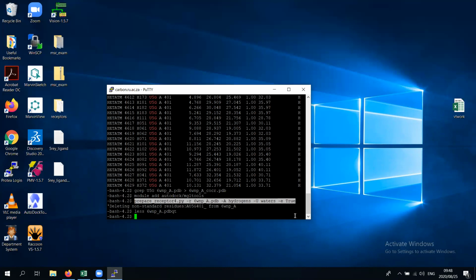And so this is what I would do in my day of work, if I've got many receptors to work with. I won't be clicking step by step. I'd rather use a script or something that helps me type this command several times rather than tediously work through many structures. Okay.